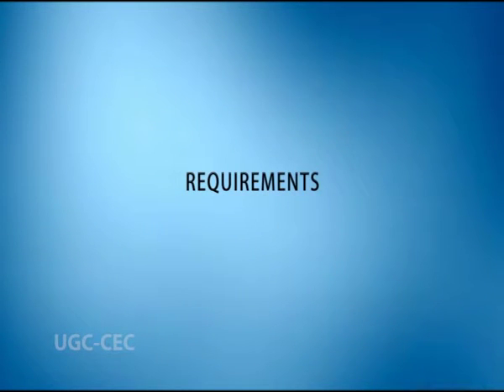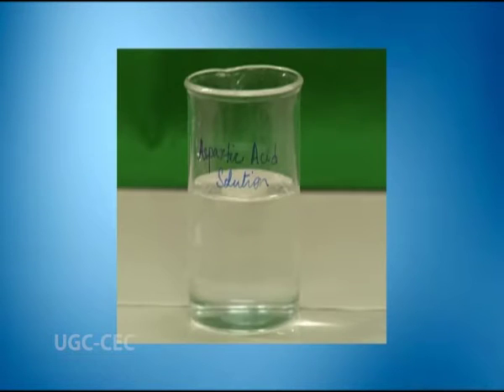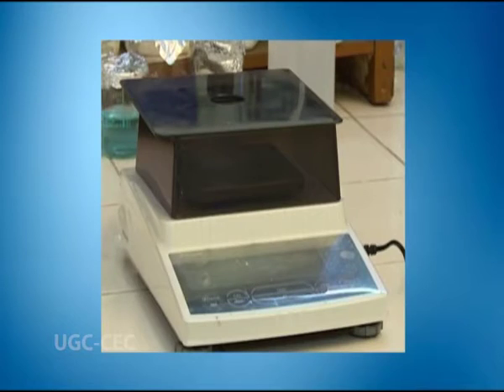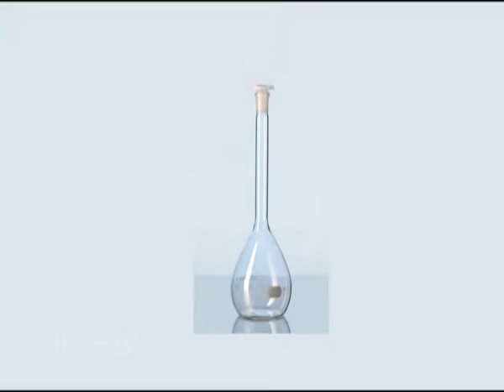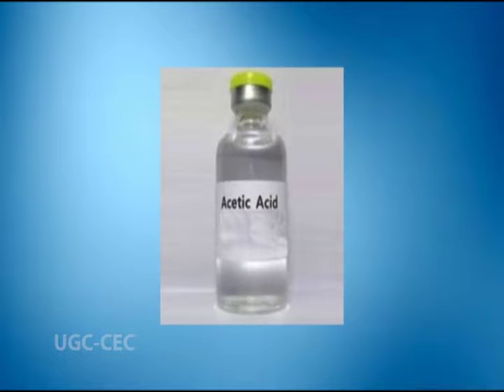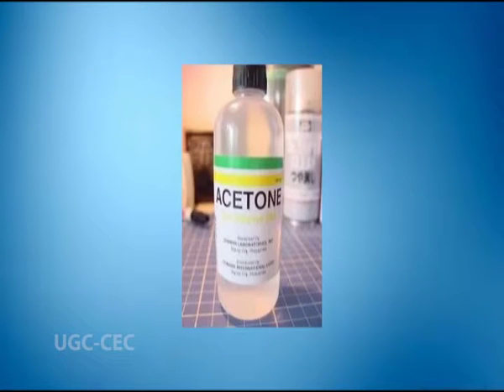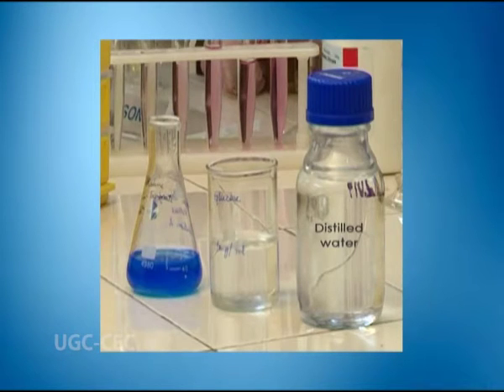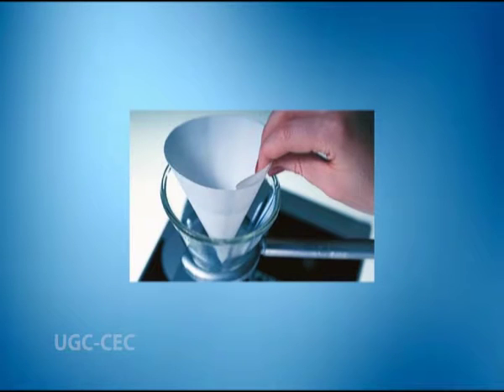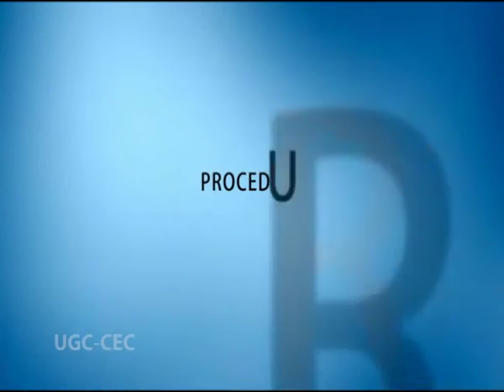Coming to the requirements: concentrated hydrochloric acid, aspartic acid, weighing balance, pipettes, spatula, volumetric flask, sodium acetate, acetic acid, test tubes, beakers, acetone, 50% ethanol, water bath, distilled water, spectrophotometer, filter paper, tissue paper. Now let us see the procedure.